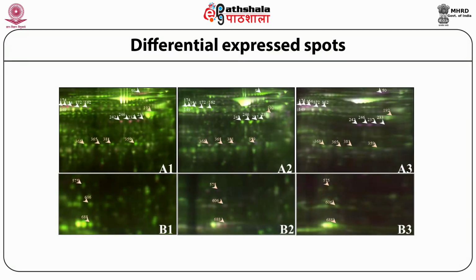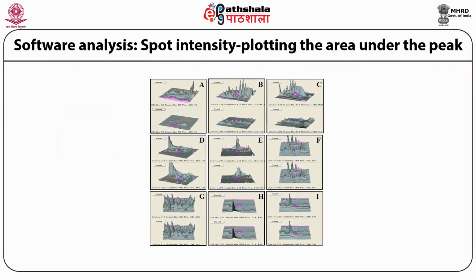Differentially expressed spots. On careful examination, we see that there is a certain set of proteins that are differentially expressed and consistently regulated across the three sets of replicate gels. Software analysis for spot intensity and plotting the area under the peak.